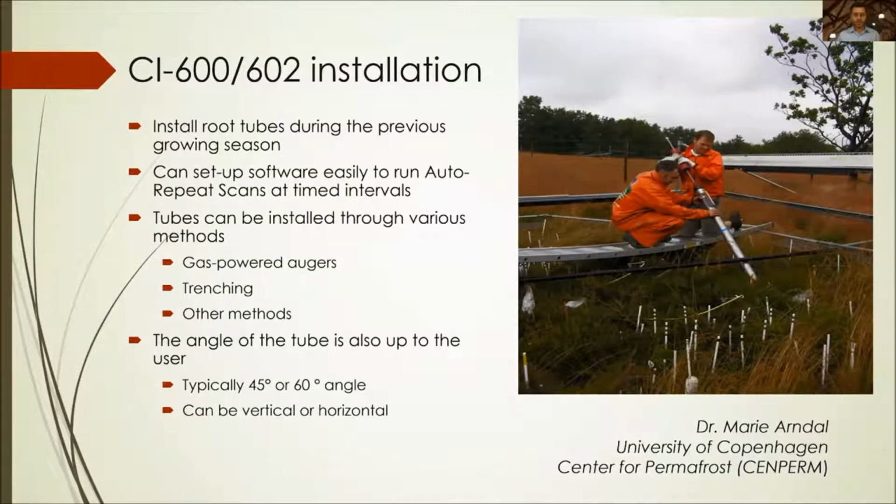Now, the other thing I would definitely mention off the bat, having run into this myself, is you want to make sure that the soil is not completely compact around the tube. You want to keep it about the same density as you would typically find around that plant. That way the roots grow as they typically would, and don't either bunch up because you've given them a lot of space to grow, or completely avoid the tube because you've compacted the soil around it and made it difficult for them to grow around the tube.